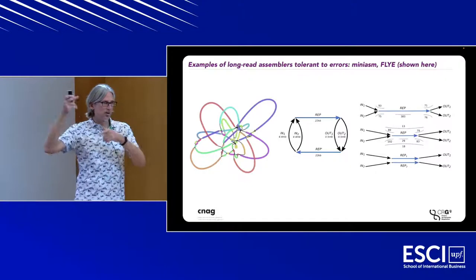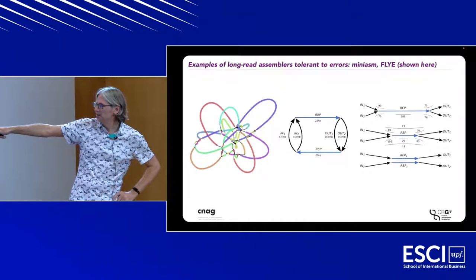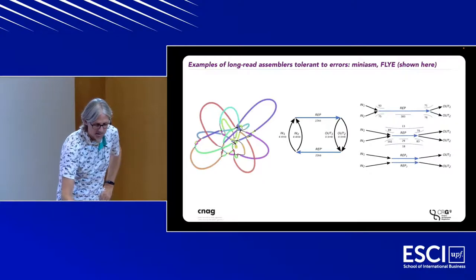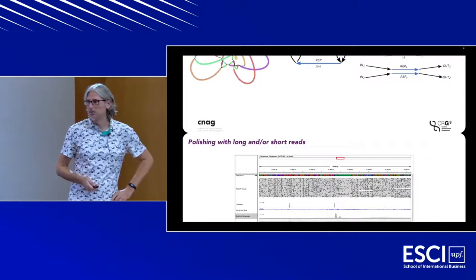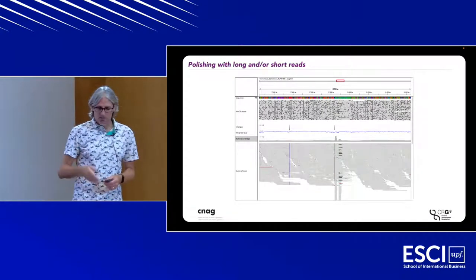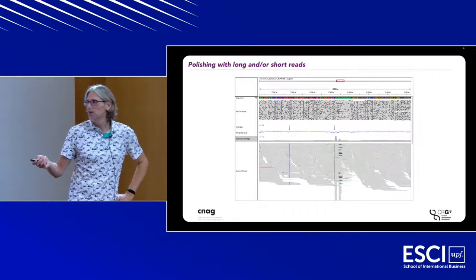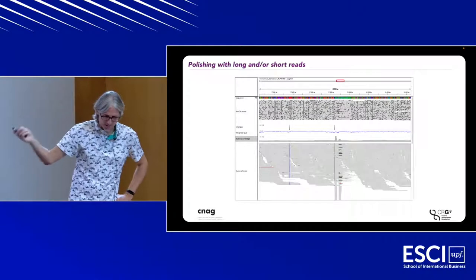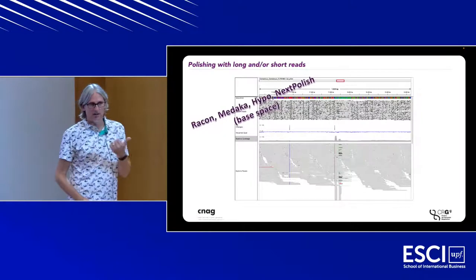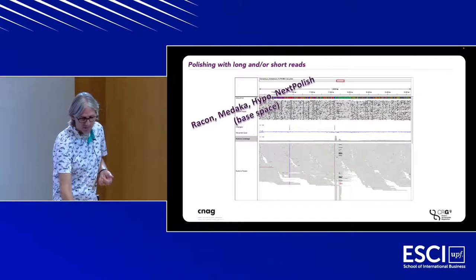Often using coverage along the edges, and is able to resolve the repeats, okay? A lot of assembly algorithms do this, and then you get a more detangled graph. There we go. So like I said, you have to polish the sequence afterwards, especially when using Illumina, Oxford Nanopore, okay? And we can usually use the Nanopore reads themselves using another program. This will fix some of the errors.